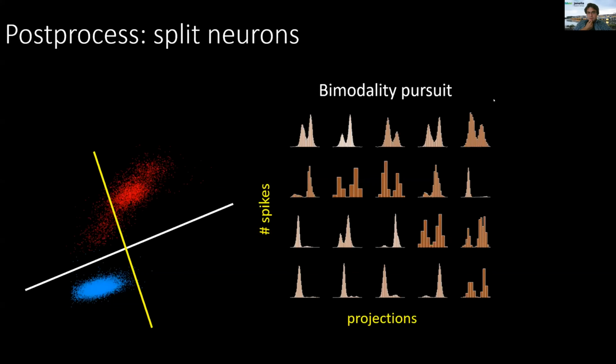Cases where Kilosort mistakes changes in overall firing rate for drift. And yeah, there is a good concern to have. I have seen an example just like that, but the recording in that case was quite poor.